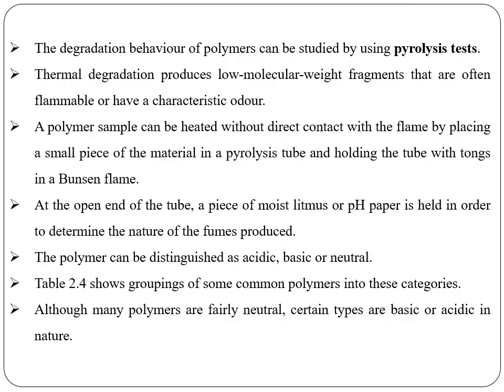The degradation behavior of polymers can be studied by using pyrolysis tests. Thermal degradation produces low molecular weight fragments that are often flammable or have a characteristic odor. A polymer sample can be heated without direct contact with the flame by placing a small piece of the material in a pyrolysis tube and holding the tube with tongs in a Bunsen flame.